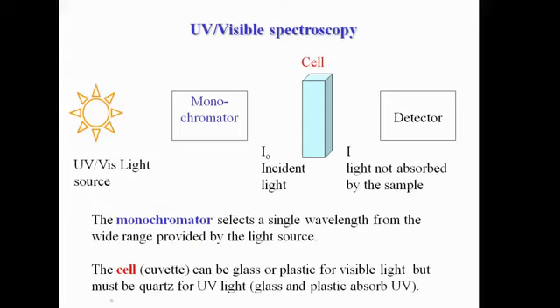So here you have, in most spectroscopies, you have to have some light source. So here we have our little animated light source. And let's see if we move on this slide. I think we have, yeah. So you're going to get some UV radiation from that. But usually you're going to get more than one wavelength. And for this purpose, we want to see just one wavelength.